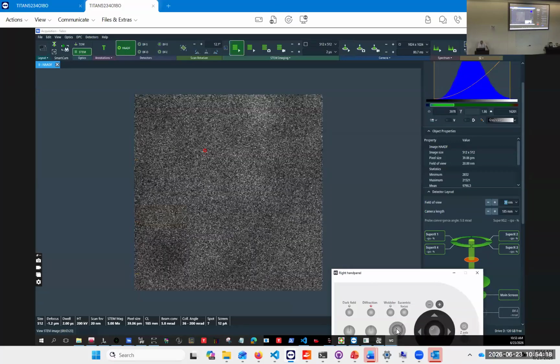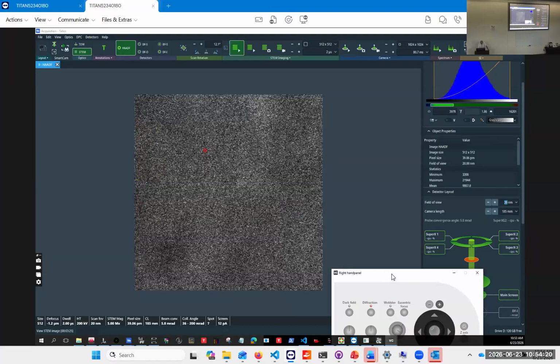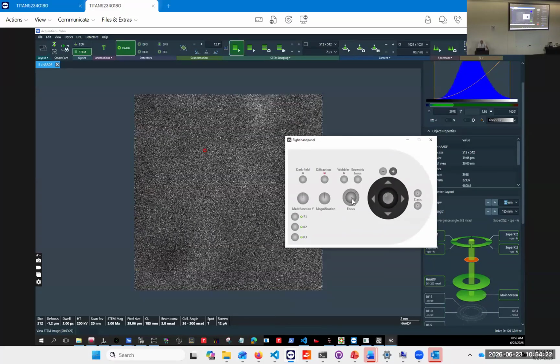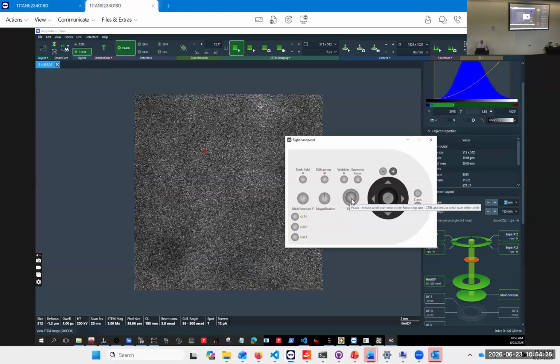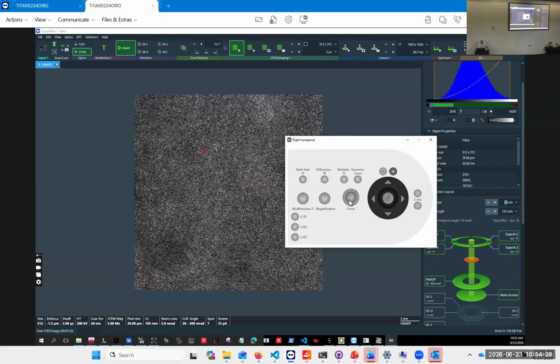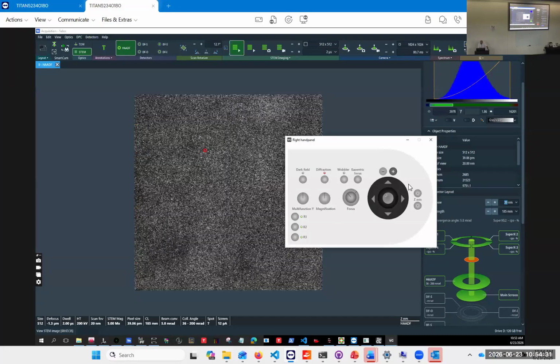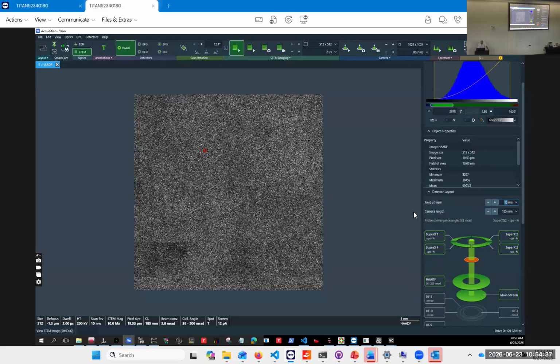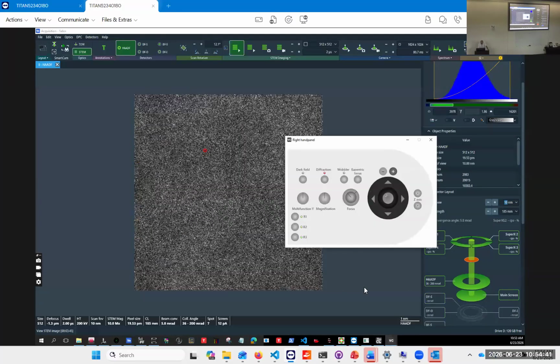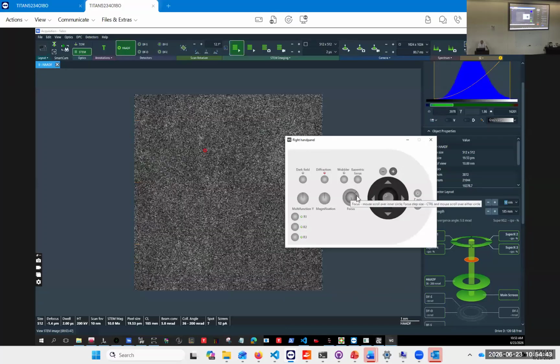So, as I said, I'm not very. Is not high enough here. I think it's good. 10.